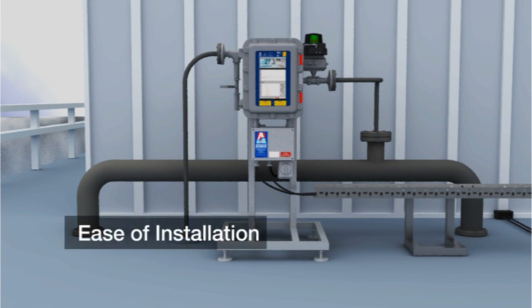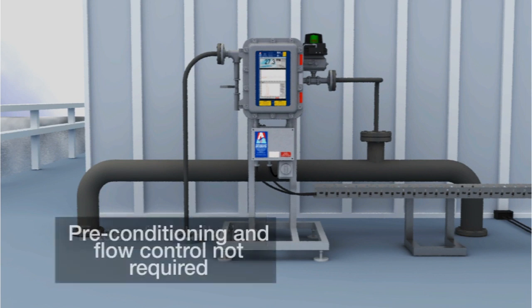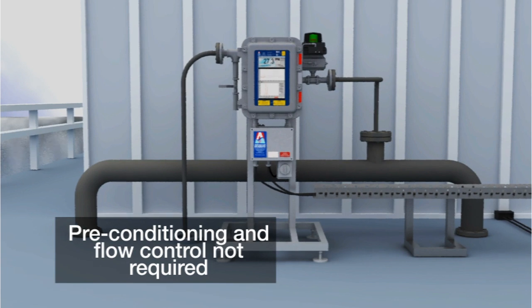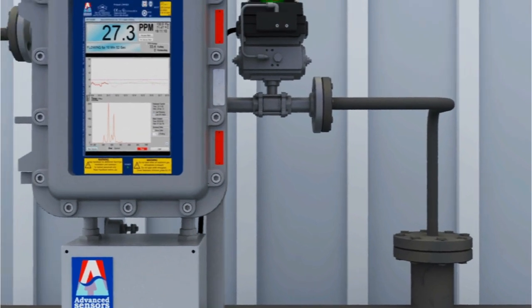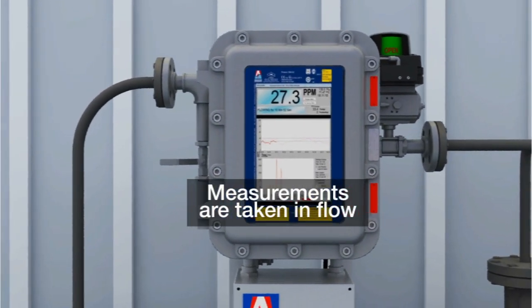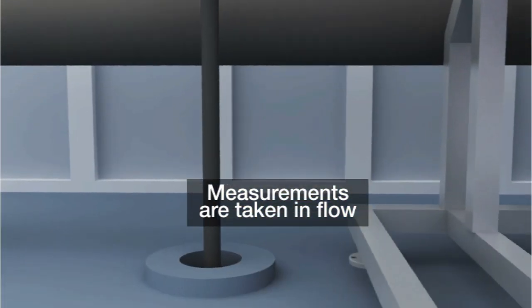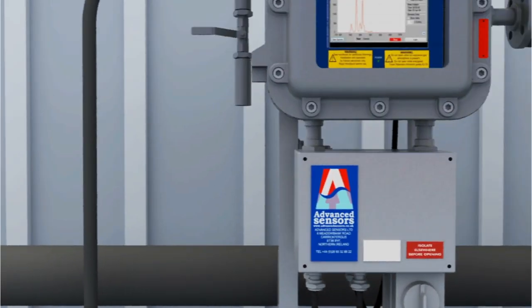Our sidestream products are ideal for ease of installation, where no preconditioning and no flow control are required. Simply tap into an existing sample point, allow flow through the analyzer where measurements are taken in flow, and then send flow back to process or drain.